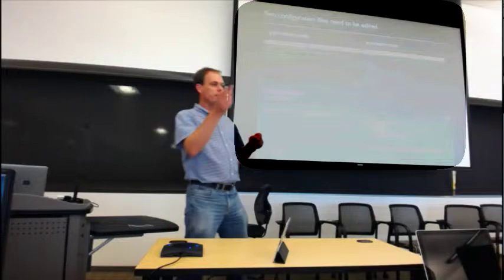Then maybe people are looking in slightly different spots. Oh, I'm sorry, it is there. Okay, that's okay. I did a bit of shenanigans copying things around so you got only the template and not all my processed data as well. Okay? How's it going so far? Are people sort of there? Can we test it to know we did it right? Is there something we can do to test it to make sure we did it right? That's the next bit.